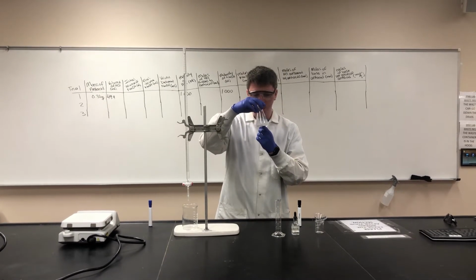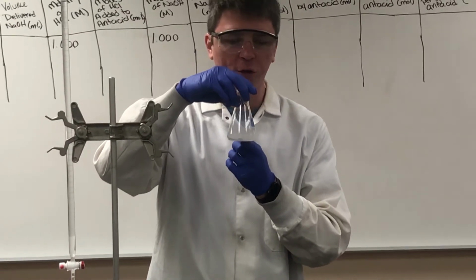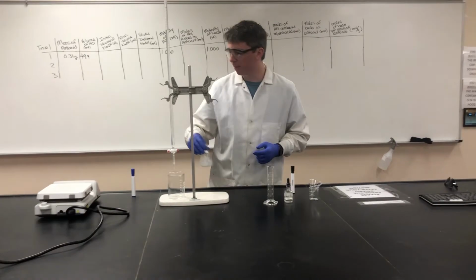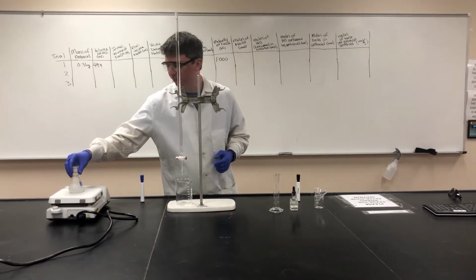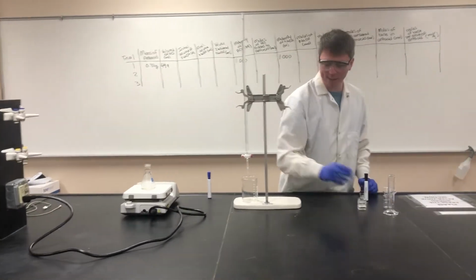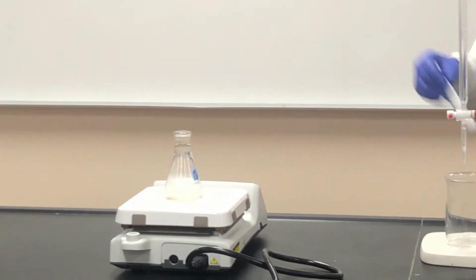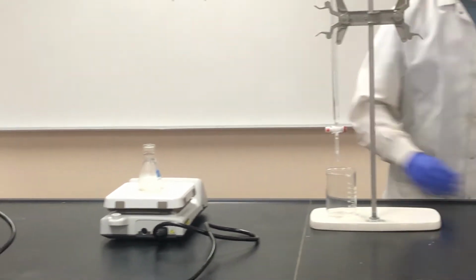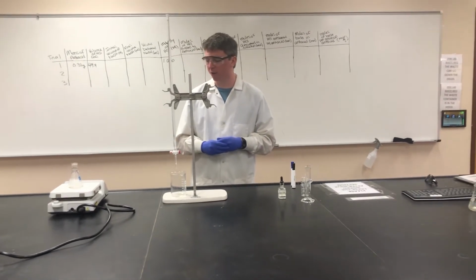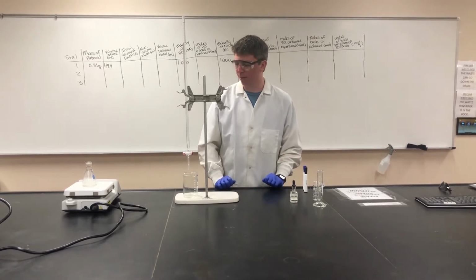And as you guys can hopefully see, this mixture has become cloudy, but it also bubbled a little bit. And that bubbling is the carbonate buffer system that we created. When you add an acid to a carbonate, you will eventually form carbon dioxide, which is what causes it to bubble. The cloudiness isn't too much of a concern. That's usually the other binders and other inactive agents that we don't really care about.